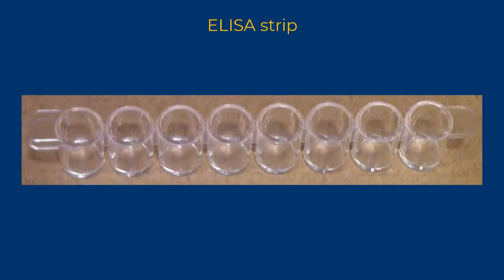The ELISA strip has eight wells and a tab at either end. Note that the tabs have different shapes to indicate the beginning and the end of the strip. The straight tab is next to well number one. The curved tab is next to well number eight.